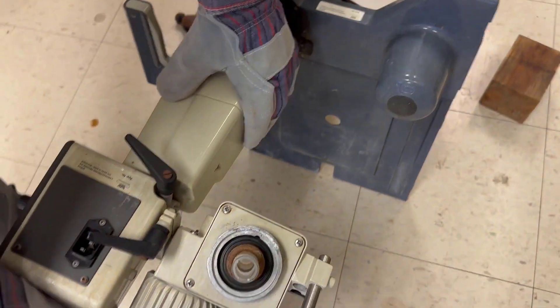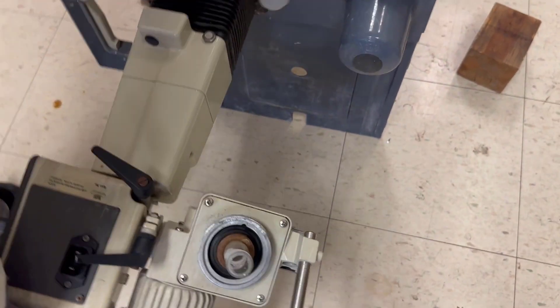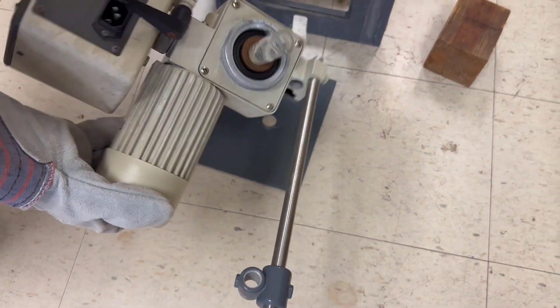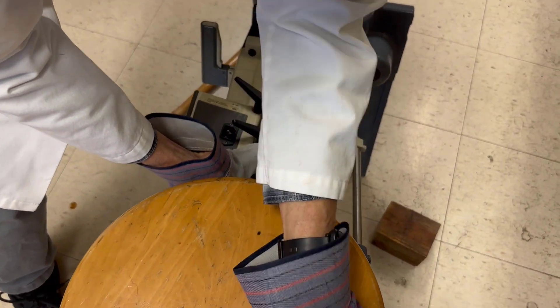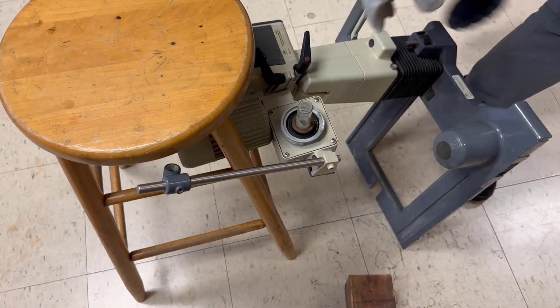We're going to take the rotary evaporator and put it on its side. Let's see if I can get it on the side — there we go. And I'll get the stool here to support it. Now I have it supported, and what we're going to do is knock this out.